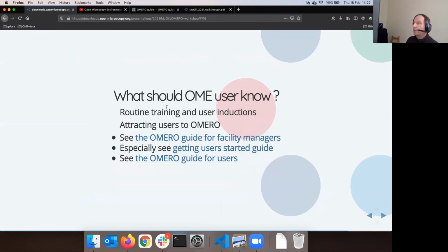Now, what should OME users know is a sentence for facility managers. I would guess that some of you will be facility managers, or are facility managers, at McGill. The majority of you must be, by the nature of things, users. But if you want to do routine training and user inductions and attract users to Omero, which you definitely want as a facility manager, then there is a guide specifically for that inside the Omero guides.